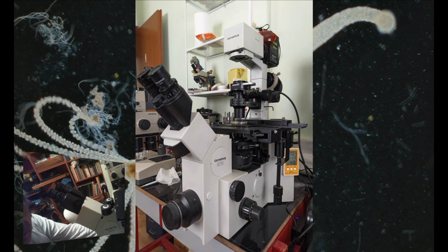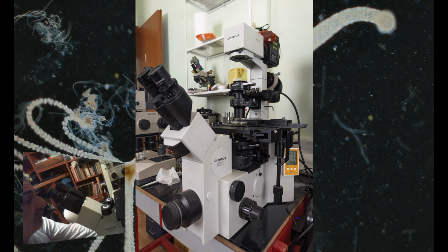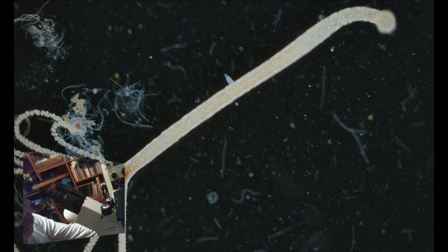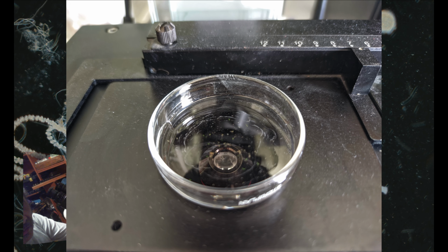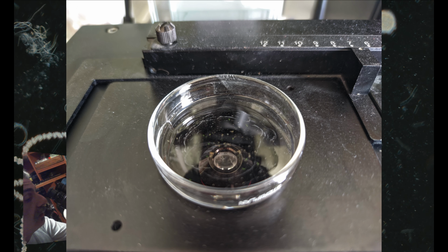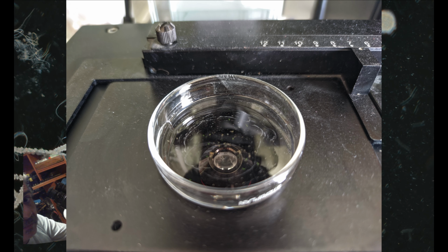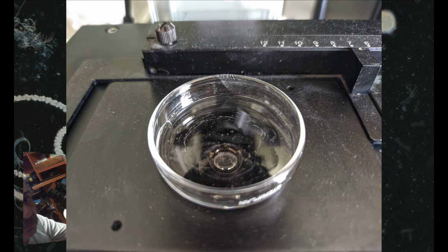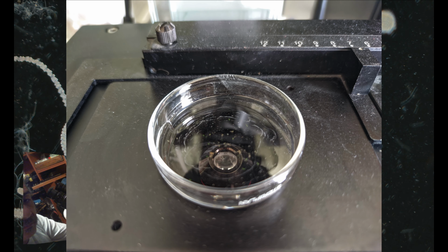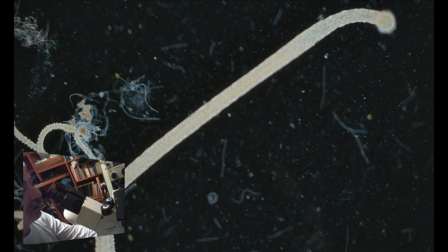We're going to use the inverted microscope today, which gives us great flexibility. We just put a little bit of water from that jar on an open petri dish, and we can manipulate them during the process and switch to very diverse illumination techniques.